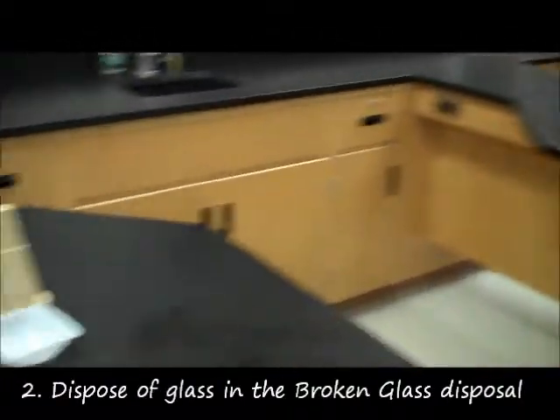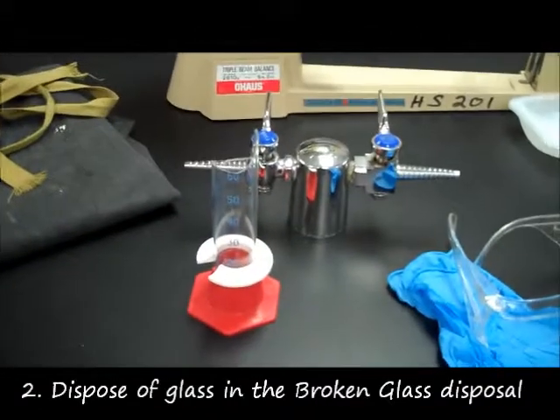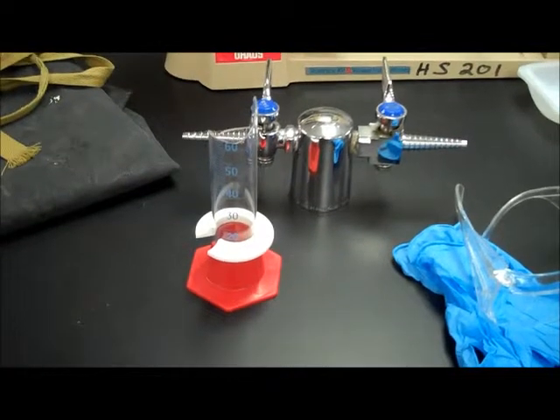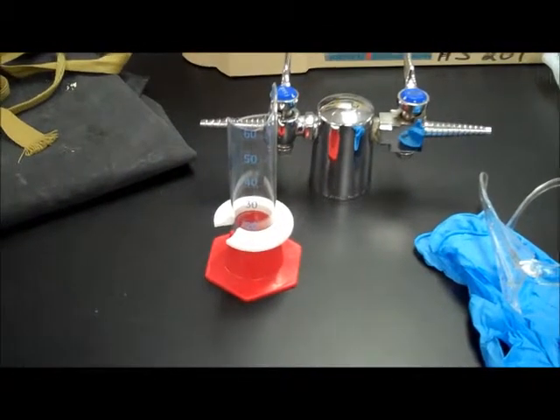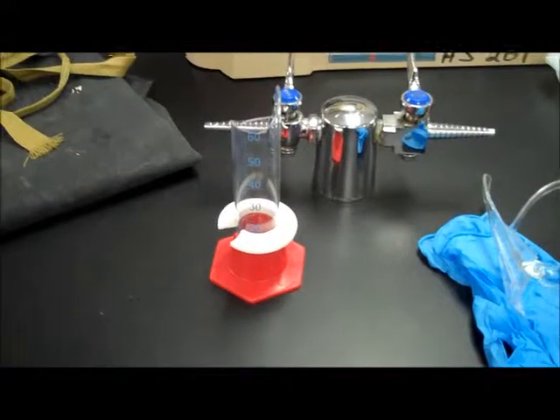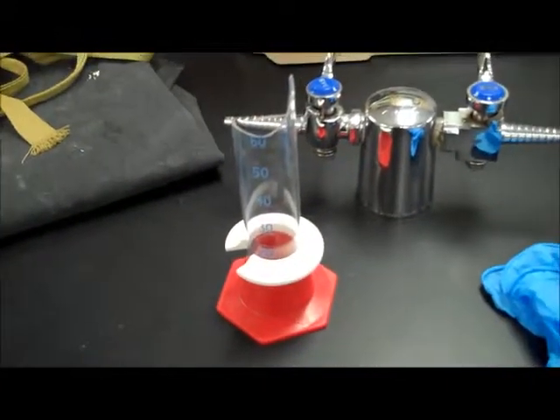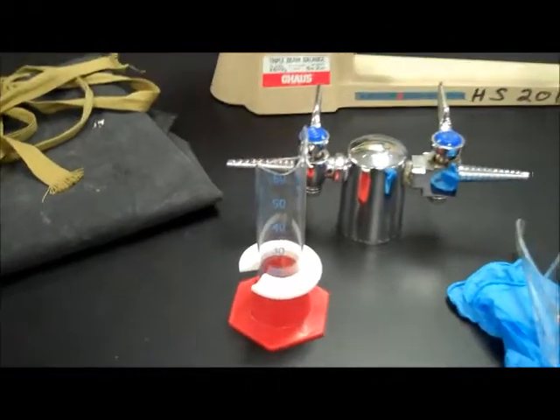The reason we put it in the broken glass disposal is so that it doesn't get into the trash can and tear the bag, and then whoever's taking out the trash might possibly cut themselves on it. So it's very important that broken glass always go into the broken glass disposal, but that students don't try to put it there themselves. It should always be a teacher who sweeps up the broken glass.